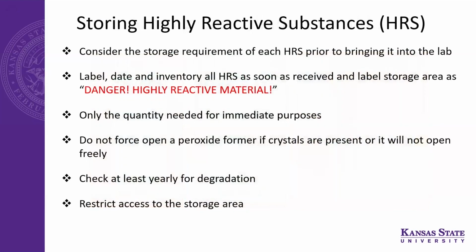Then, talking about storing highly reactive substances, I have the abbreviation HRS. Consider the storage requirements of each HRS prior to bringing them into the lab. Think ahead, and label the area. Have a designated area and put them in the designated area, with a label so that others will be able to recognize it, something like danger, highly reactive material, or something along those lines.